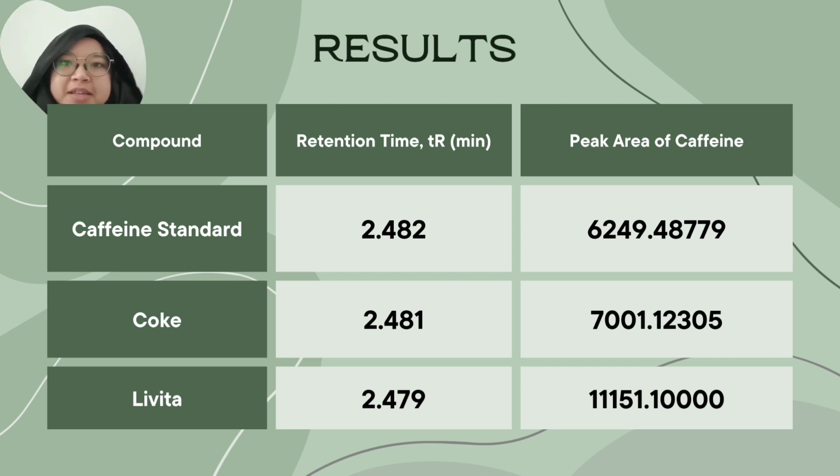The Coke sample displayed a retention time of 2.481 minutes, almost identical to the standard. This confirms the presence of caffeine in the soft drink. Its peak area was 7,001.12305, indicating a higher concentration of caffeine compared to the standard.